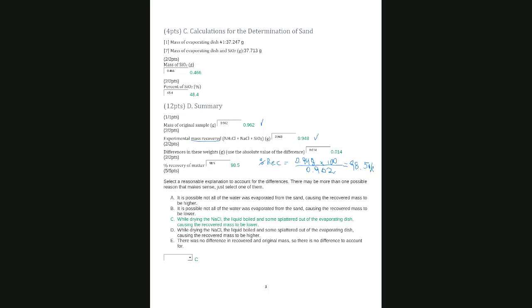Then when you weigh, you think it's dry, but you are adding a weight that is not the dry substance only. It's the substance plus water. So that means you didn't dry enough. This is a question that will come at some point in the report.